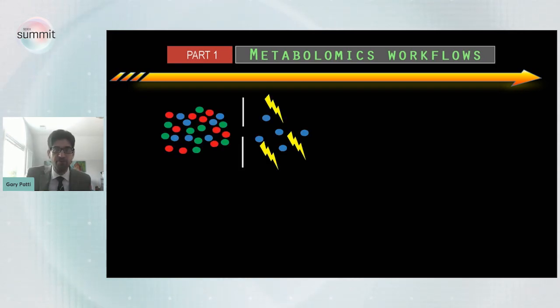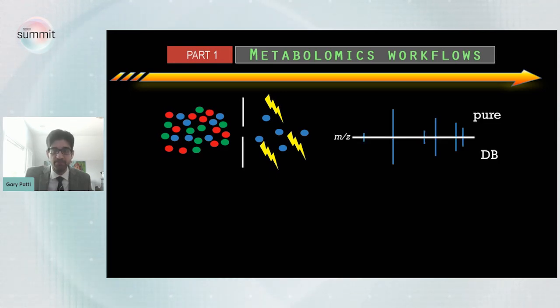Okay, so without further ado, what do I mean by chimeric spectra? Well, when you're doing metabolomics, as I alluded to earlier, you have to collect fragmentation data to support structural identifications. To do that, we collect a precursor in the mass spectrometer and we fragment it. In this particular example, I'm showing you 3 different precursors and they're all color-coded. We have some precursors that are blue, some that are green, and some that are red. What we like to do is isolate just one precursor in the fragmentation cell and then break it apart. That means that all the fragments we measure in that MS experiment come from the blue precursor.